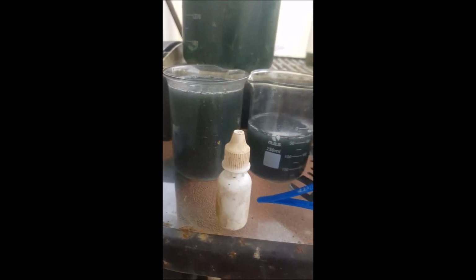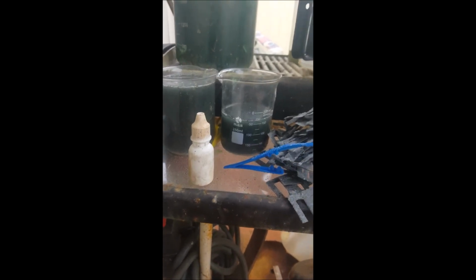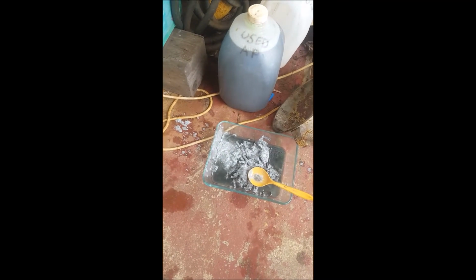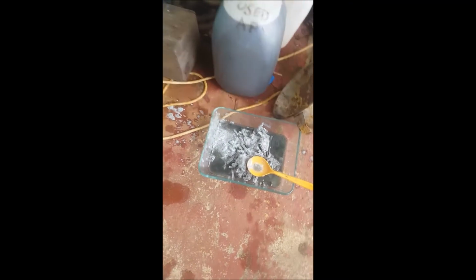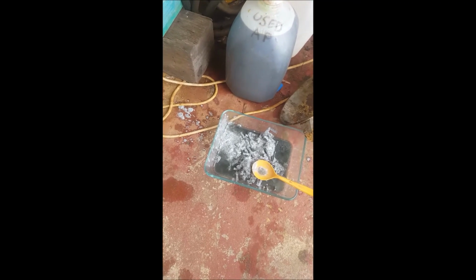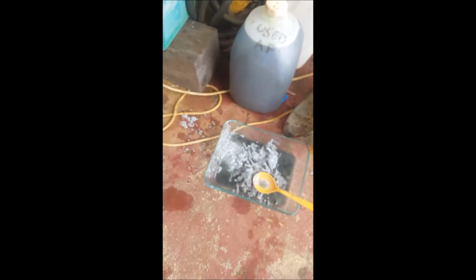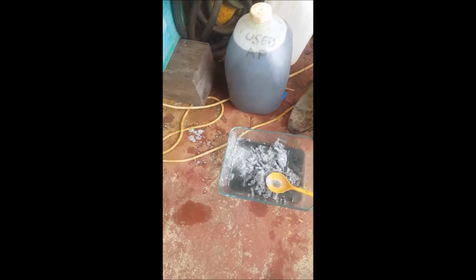And then there's the solution I separated from it. That's got to be filtered yet, so I'm waiting for that to cool down a little bit so I can filter it. And then I put it back in the pot, from what I understand, and heat it and heat it until it reduces and crystallizes. But these crystals here can be used, so they're like an emerald green colour. I don't know if you can see on the camera, but they've come out like a light green, which is what we need. And I can use that liquid now if I had some gold to precipitate, but I don't. So alright, we'll get back to it in a minute.